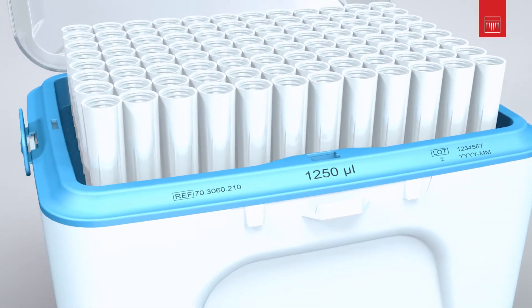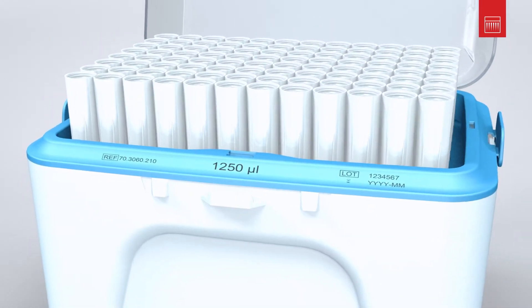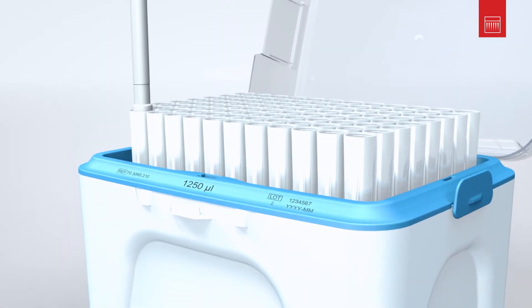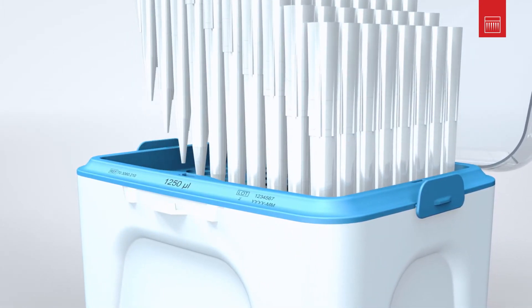You will find important information like the batch number and shelf life directly on the tray, durable and clear. The system's high stability makes removal even more convenient. This increases safety and optimises your work process.